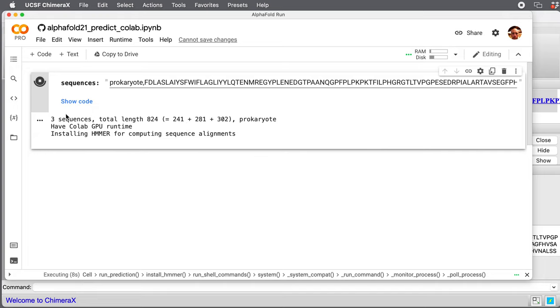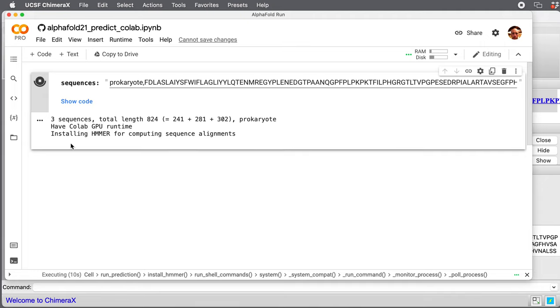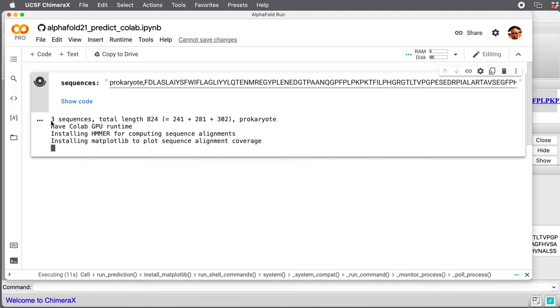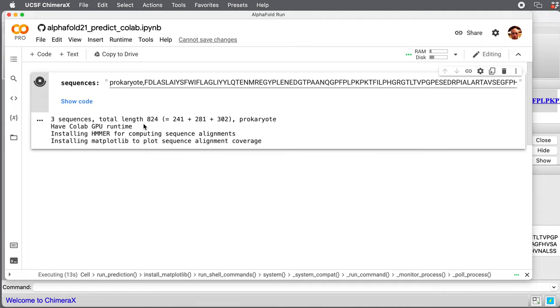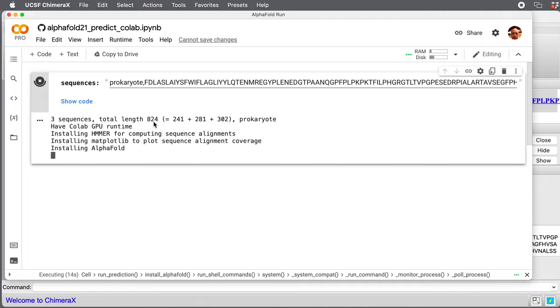Chimera X has sent instructions to a server at Google saying to install AlphaFold. What's going to appear here is a log. It says we have three sequences. The total sequence length is 824 amino acids. Each of the proteins is 200 to 300 amino acids, and it's a prokaryote.